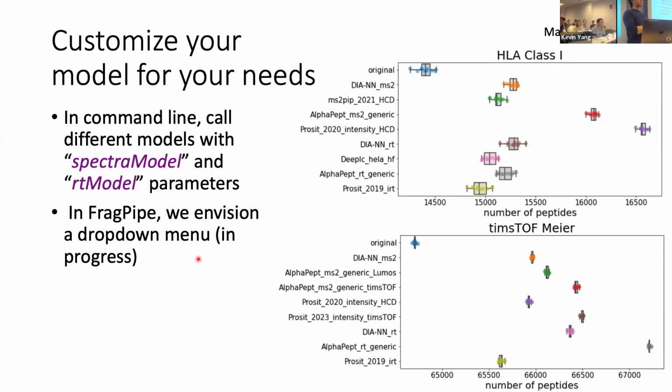Typically you get a positive weight for this MS2 similarity score. But we've seen that, at least in the case of adding cosine similarity, spectral entropy and Pearson correlation together, those are all correlated. When you add those all together, you start to get negative weights for some of them, which starts to not make sense. And you don't actually fundamentally get any statistically significant boost of peptides after that.